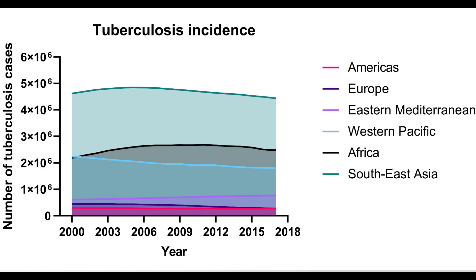There is a way to resolve this within Prism, and that is by using semi-transparent colors as your fill colors. I'll explore that in more detail later on in the video tutorial. So in this video tutorial, I will show you how to create this particular area graph. Let's go into Prism and begin the tutorial.